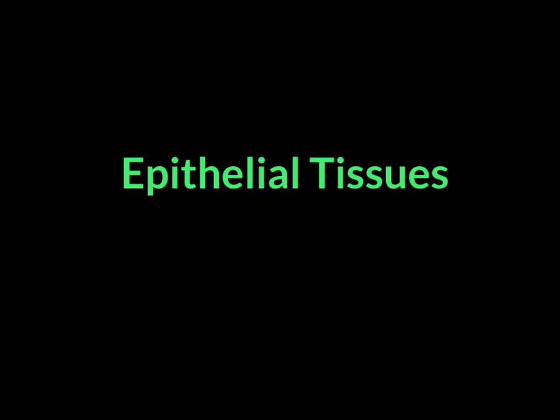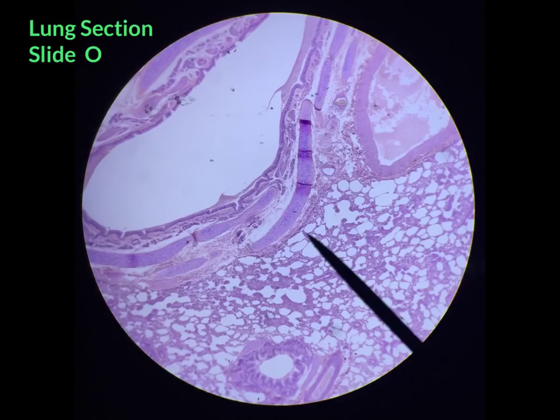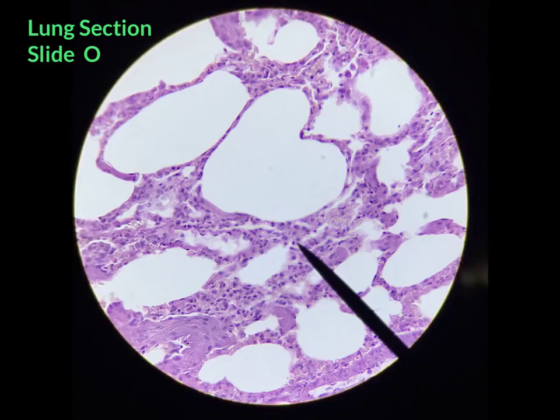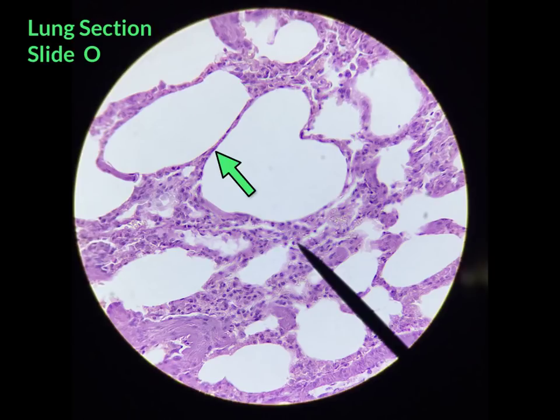Let's start with epithelial tissues. The first tissue you'll be identifying is simple squamous epithelial tissue, and it will come from the lung section from slide O. When you look at slide O under low power, you can see a variety of different tissues. The area to look for simple squamous epithelial tissue is the alveoli — the tiny little air sacs found within the lungs — whose walls are composed of simple squamous epithelial tissue, as shown here.